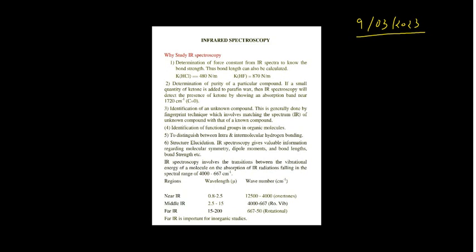Now, your second important application. For example, say you have paraffin wax. What is the meaning of paraffin wax?